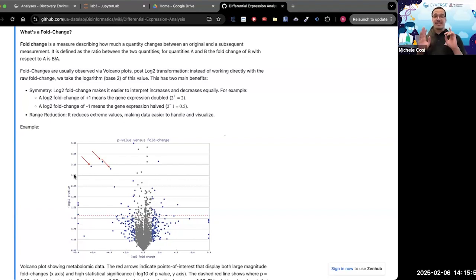to keep in mind. This is a really bad explanation, but if I were to bring it back to something easy to understand, look at the dots that are further away from 0.0. Those are the ones that we need to keep in mind.